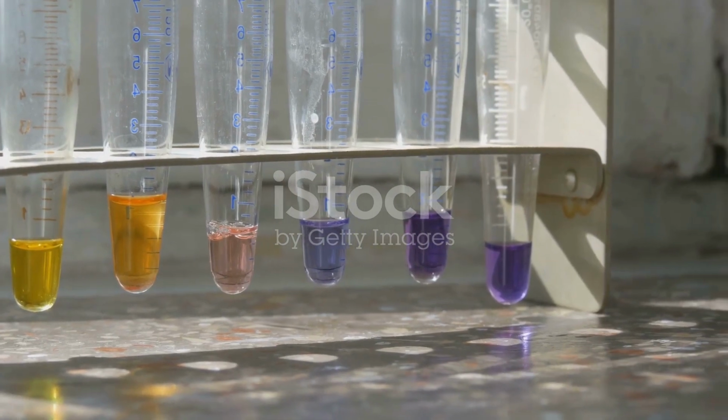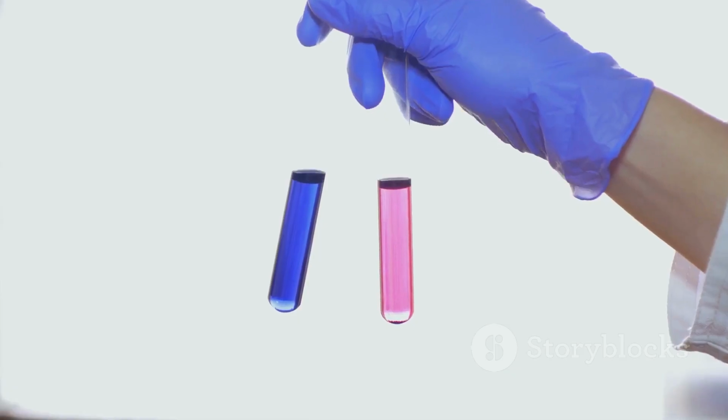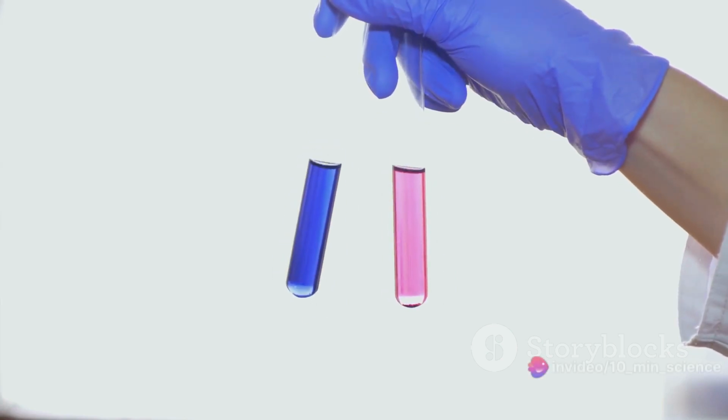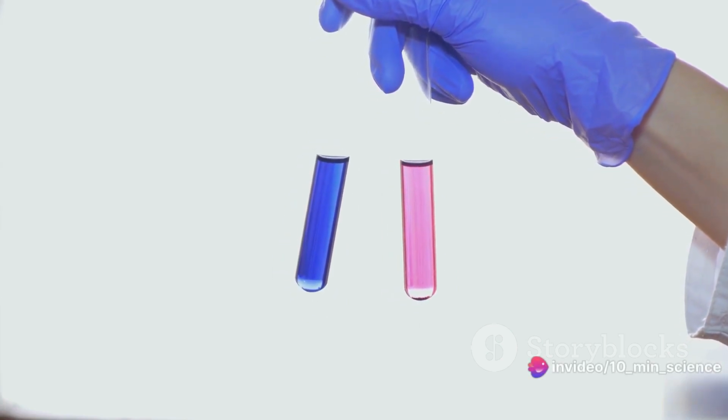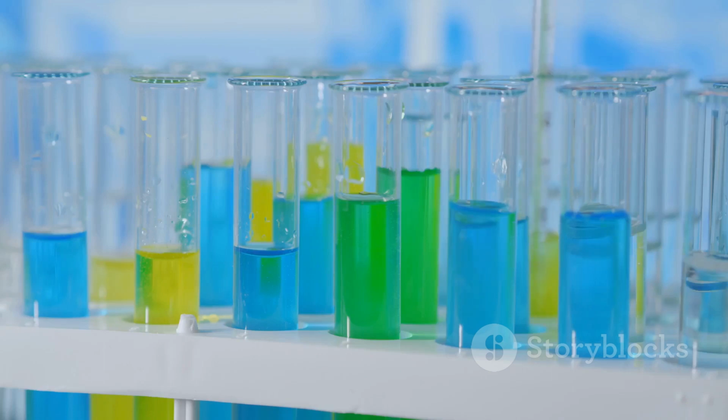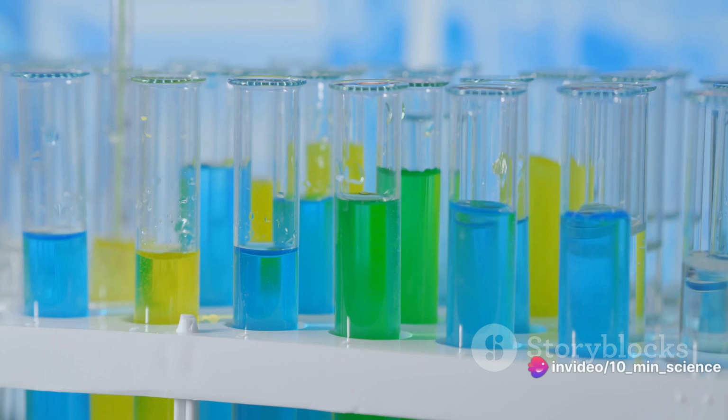Firstly, we have the mobile phase. This is the solvent that carries your sample through the column. Changing the composition of the mobile phase can significantly influence the separation. For example, altering the ratio of organic to aqueous solvent can change the elution order of analytes. A careful balance is needed here, as the mobile phase needs to be strong enough to elute the compounds yet gentle enough to preserve the column.